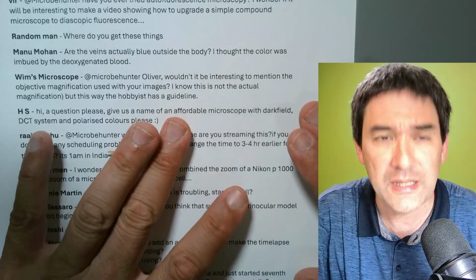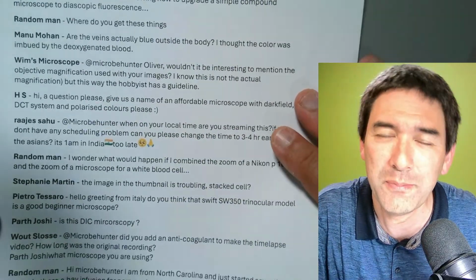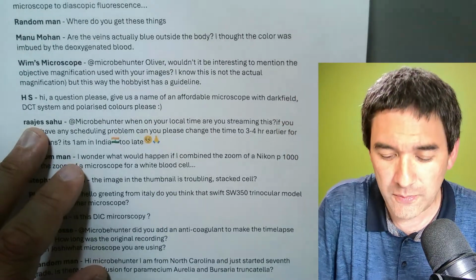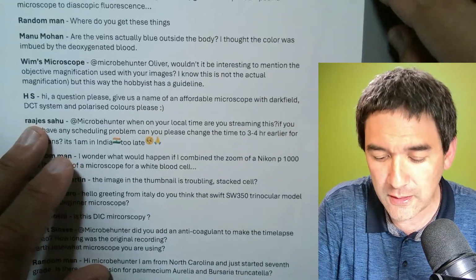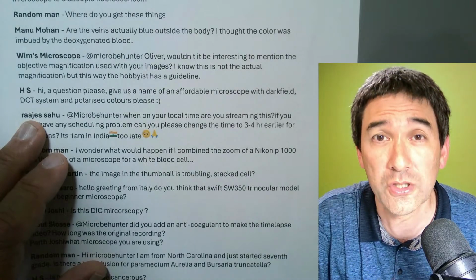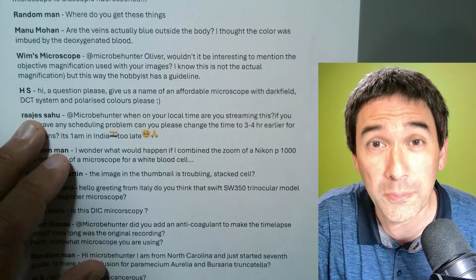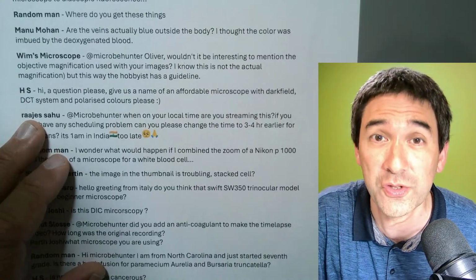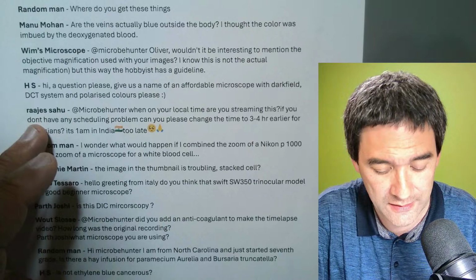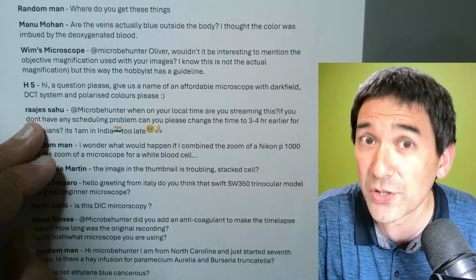And I always say, if there are multiple conflicting views on a certain issue, probably then it becomes a question of taste, depending on what your expectations are. So in my other YouTube channel, I've made some reviews. I've in the past recommended some models of Swift, the company Swift. Euromex, a European company from the Netherlands, has excellent microscopes as well. Full range, so you might also want to check out their website. But a lot is a question of personal preference as well.